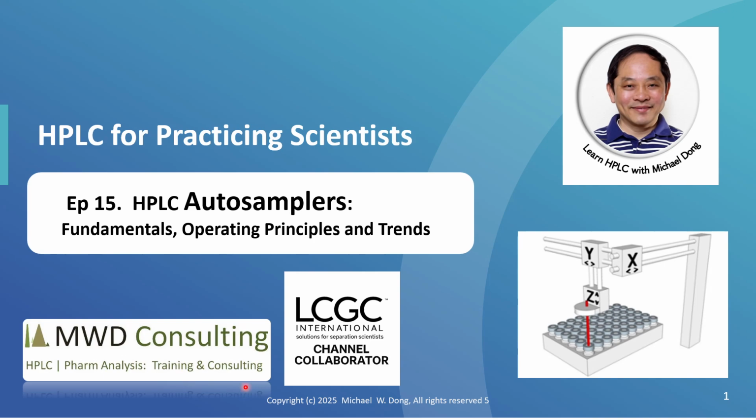Good morning. This is Michael Dong speaking on HPLC Autosampler fundamentals, operating principles, and modern trends.